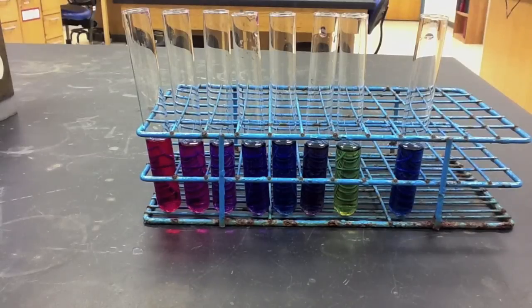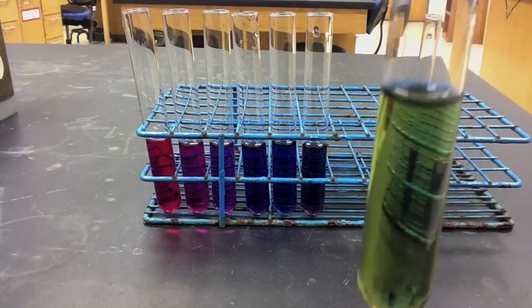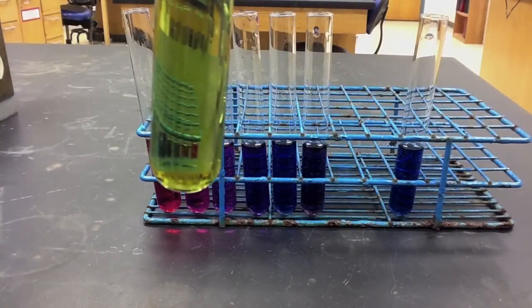Notice that the pH 12 buffer and anthocyanin mixture initially started out as a dark green color at the beginning, but then slowly faded to a light yellow color.